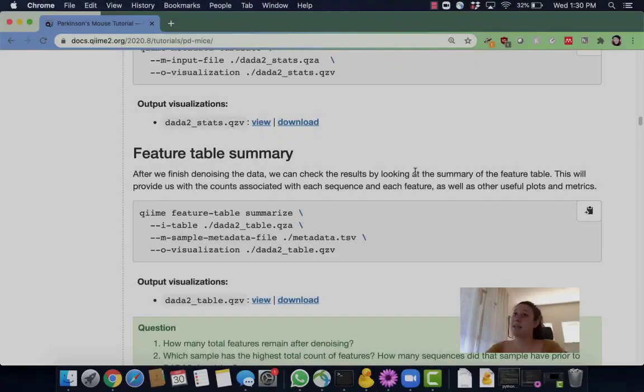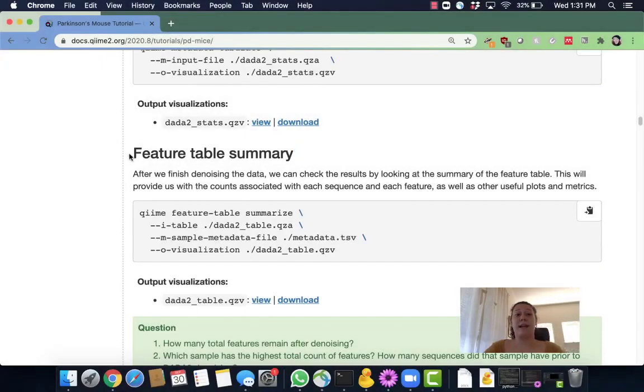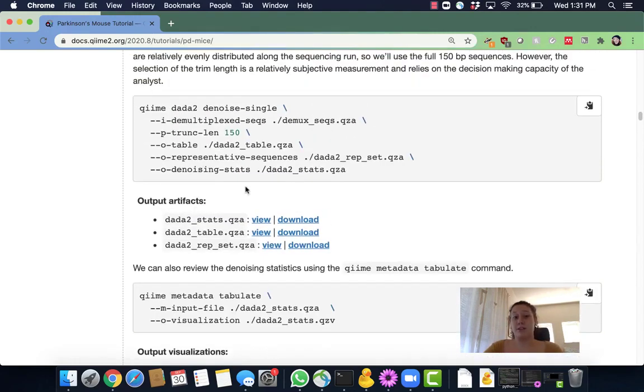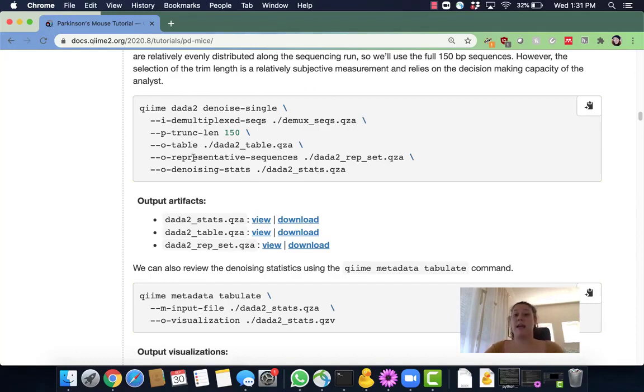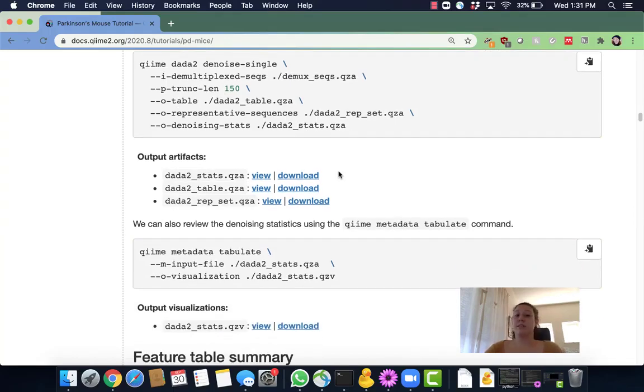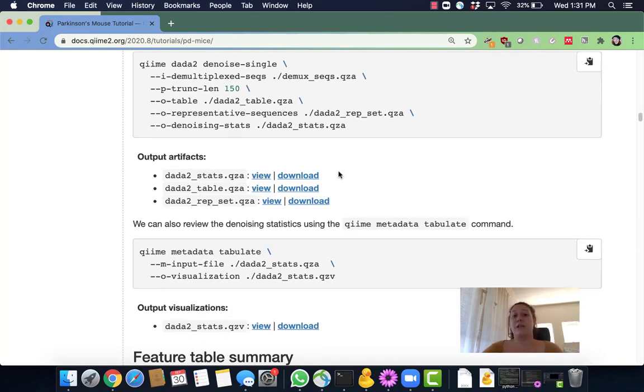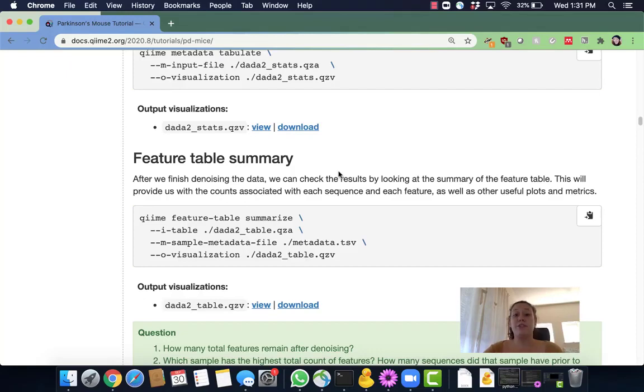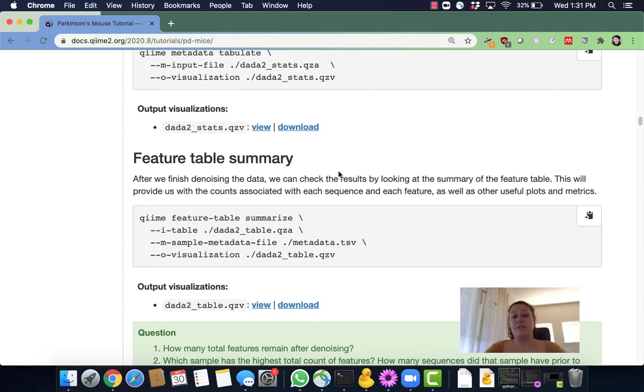In this section we are going to be generating a feature table summary. Now that we've effectively run DADA2, we have our DADA2 results. So we have our DADA2 table.qza, our DADA2 rep-set.qza, and our DADA2 stats.qza. We have looked at our stats.qza which allows us to see how our denoising went, and now we need to create a summary or a visualization for our DADA2 feature table. The feature table includes counts associated with each sequence and each feature that will allow us to gain more insight on our data.